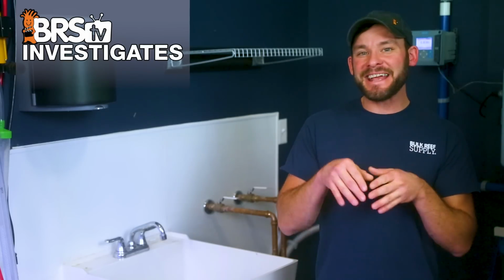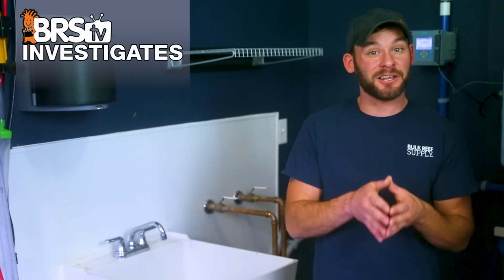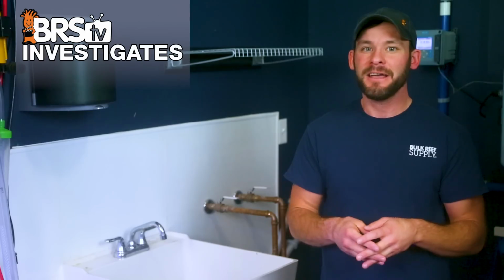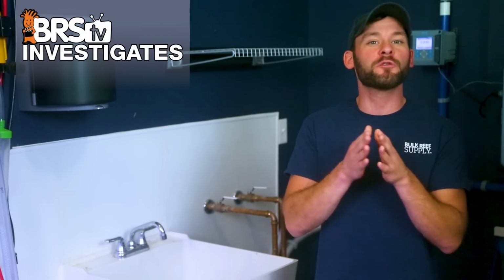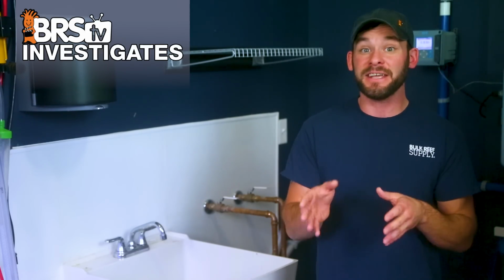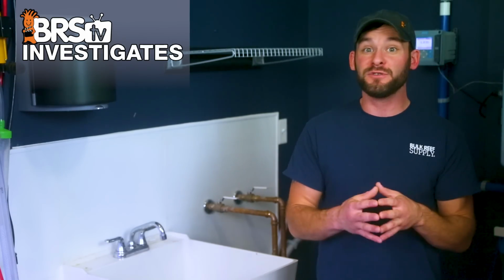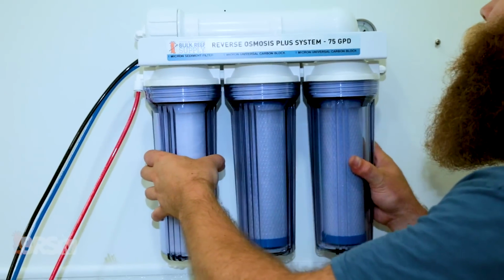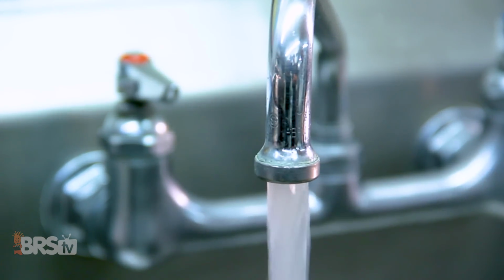Because of that, and for today's experiment, we're not going to try to decipher or speculate as to each element's results and what they mean. Rather, the point of today's experiment is to try and draw out similarities and notable differences between our city and well water samples in order to find out if there's a better way of choosing a more adequate RODI filtration approach for your specific water source, or if you even need one to begin with.